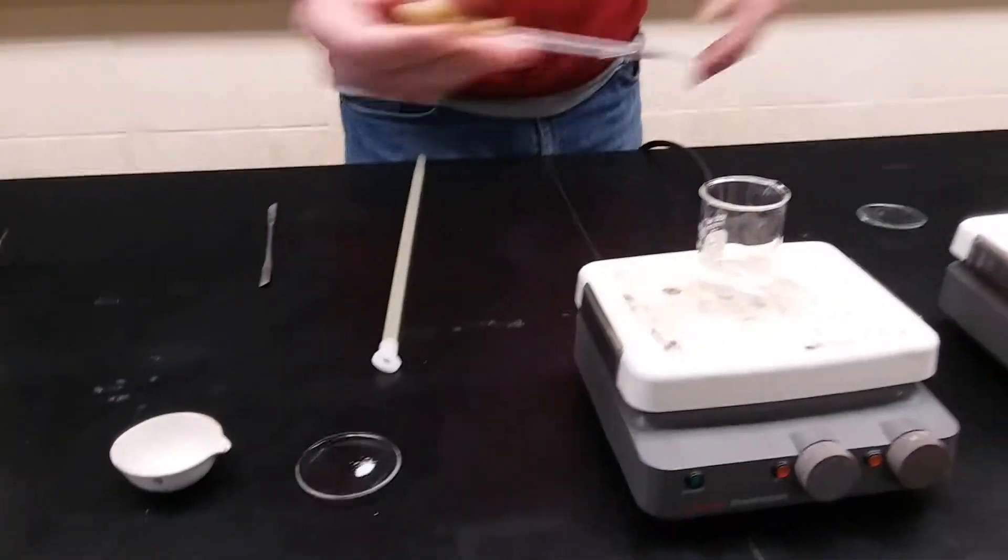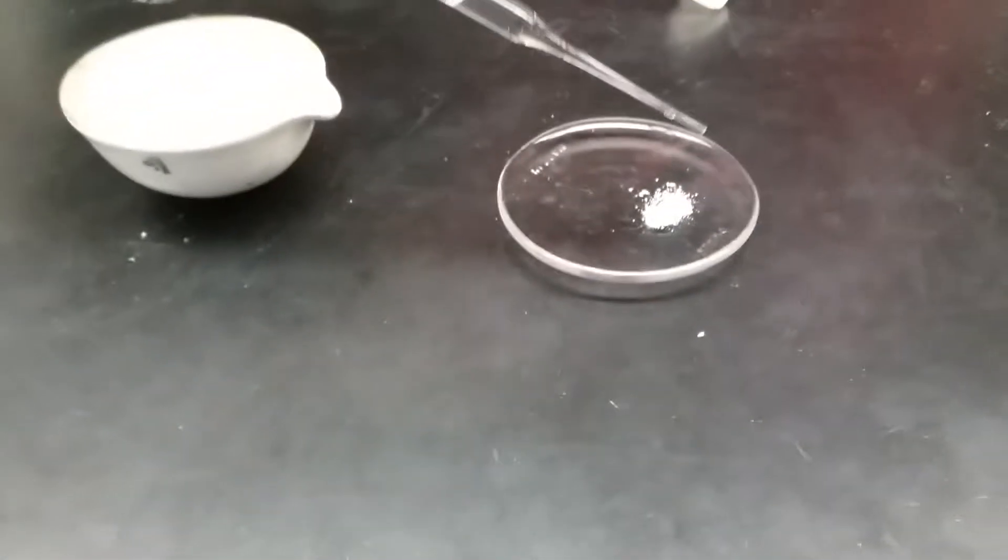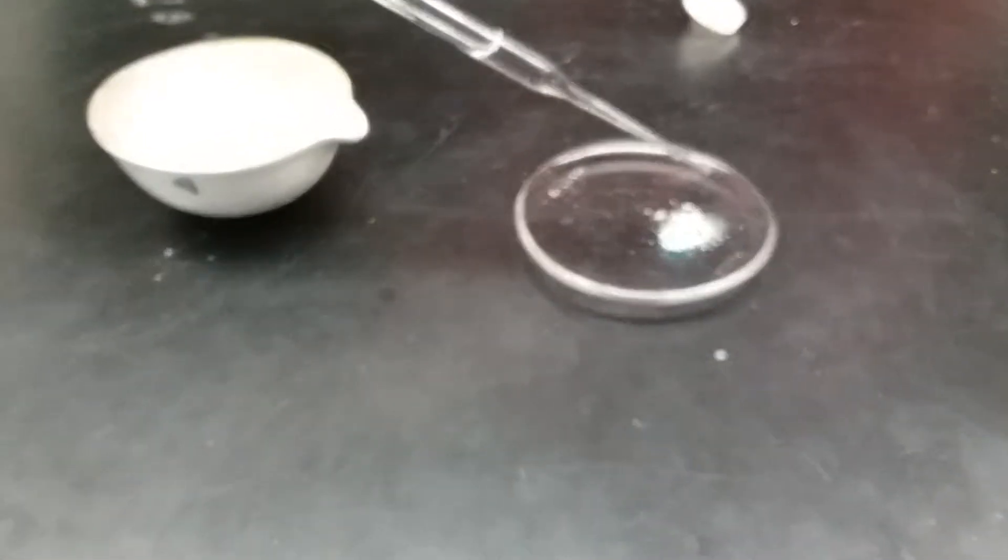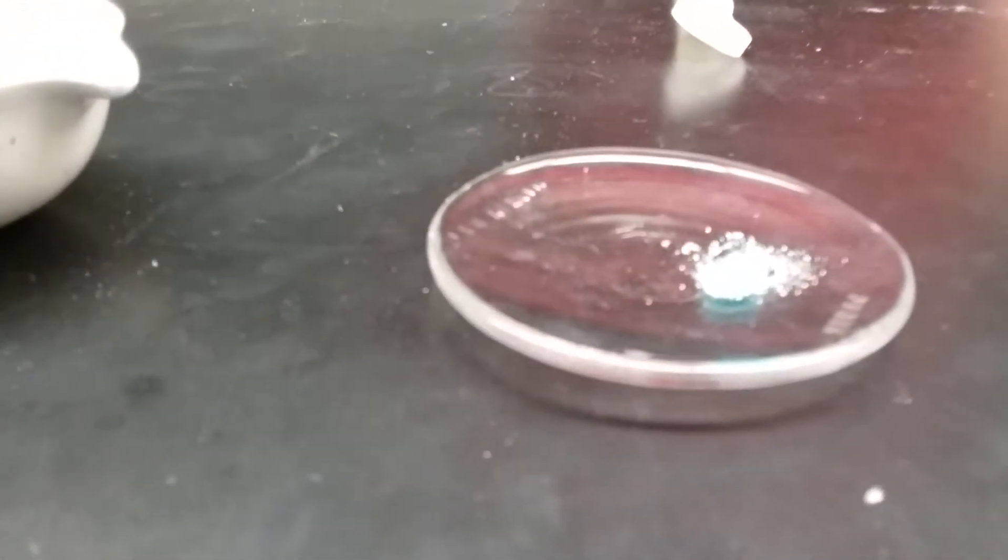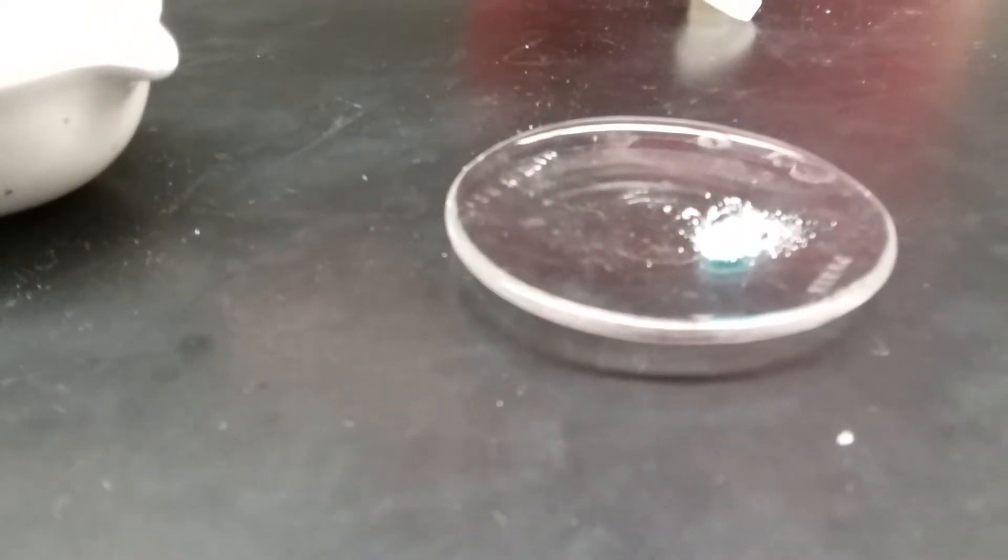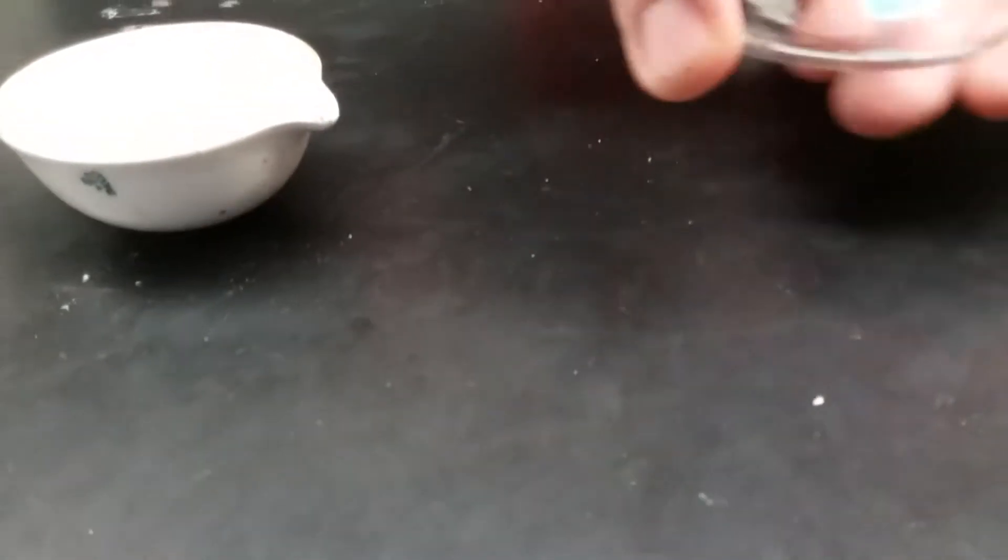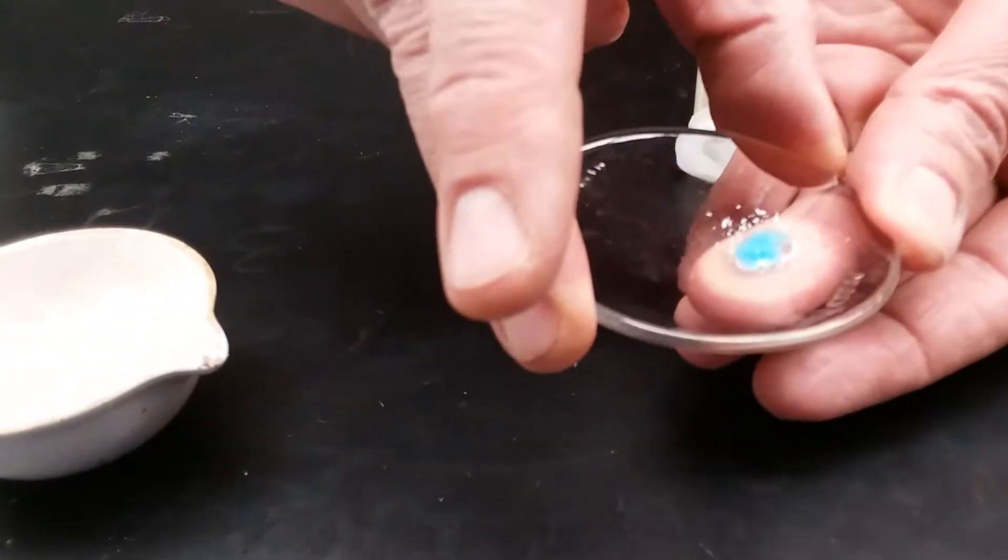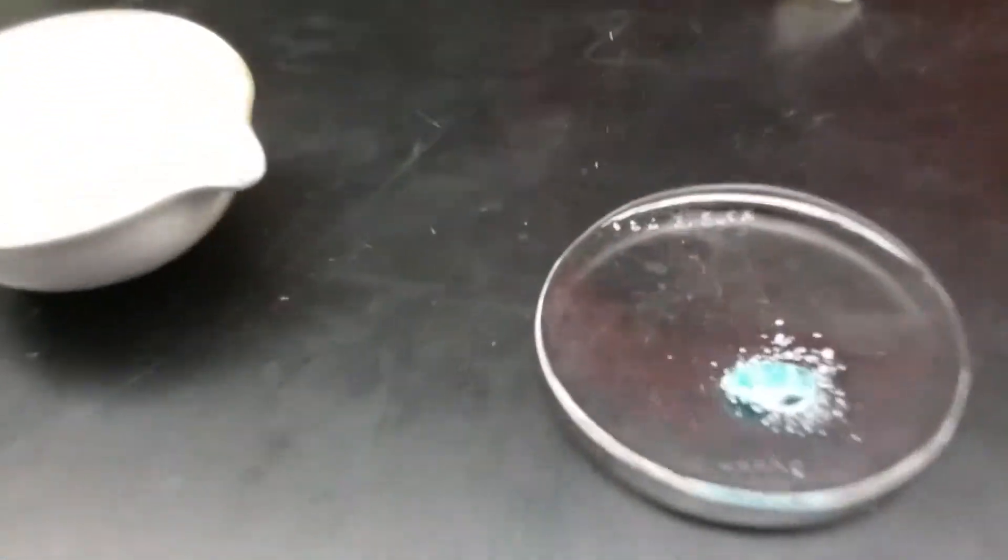This is just deionized water in these two beakers, and look what happens. A little steam is given off because this is an exothermic reaction. It was endothermic to drive the water away because I had to heat it. So the reverse should be exothermic, and it's actually a little bit warm underneath the watch glass there. The thing is, when you put the water in there, it makes it blue.